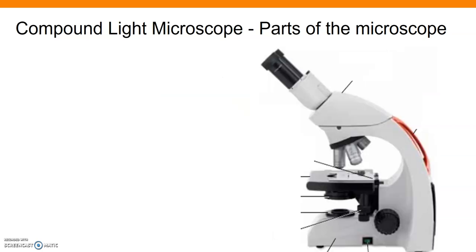As we flip this scope around, we're now looking at the other side. If you were looking through these oculars right here, your right hand would fall on this side. This is where a lot of the mechanics are. The microscope, like everything else in our world, is meant for right-handed people because there's a lot of control features right here.